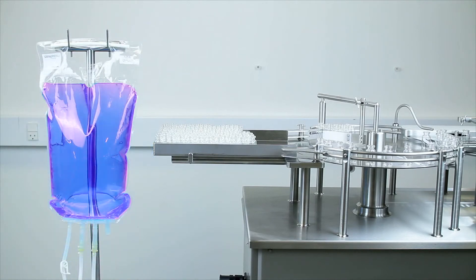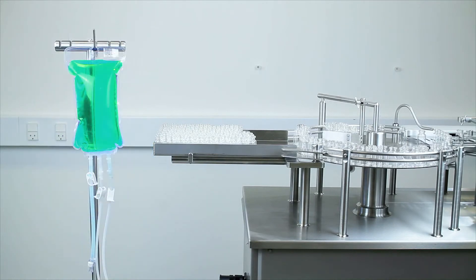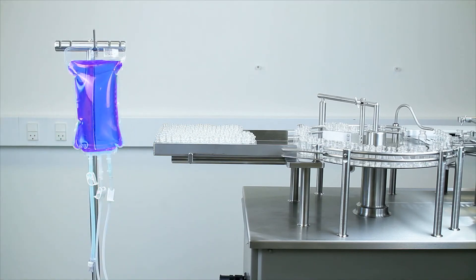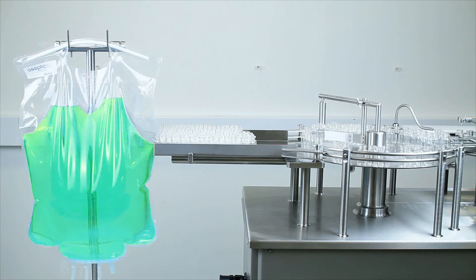Once the filling process is complete, simply remove the Aseptic SU unit and as the liquid being dispensed is not in contact with any mechanical part or permanent plumbing, there is no risk of contamination between batches.